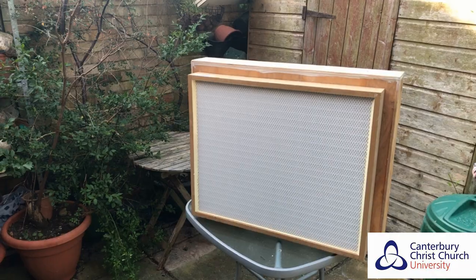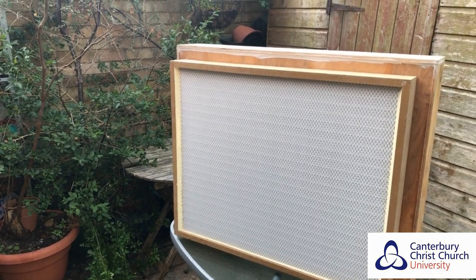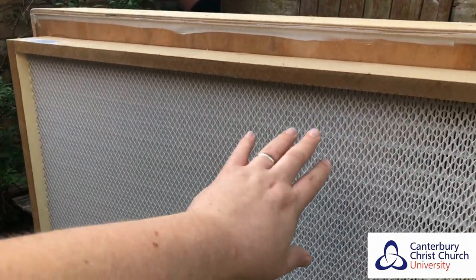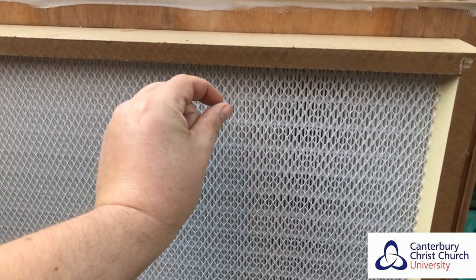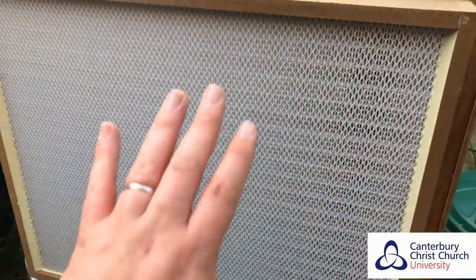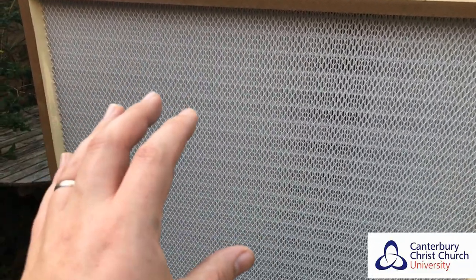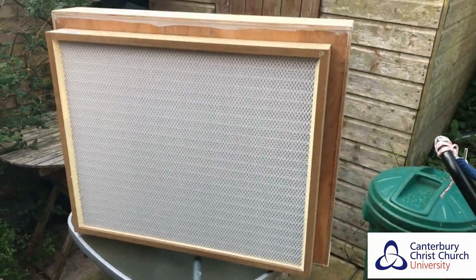If I take a small amount of that tissue and place it onto some clean sterilized agar, I get something that grows like what I'll show you shortly. One of the other things we can use in a clean lab to make this happen effectively is what we call a laminar flow hood — a very simplified or filter hood version. There is a thin filtered mesh here, very fine — just a couple of micron particles can get through — with a fan behind it. This pushes air through the mesh so it comes out very clean and ultra-filtered, keeping cultures clean and free from unwanted bacteria or fungi.